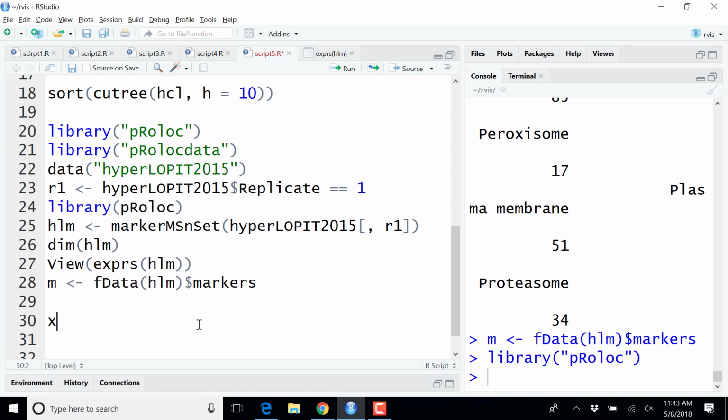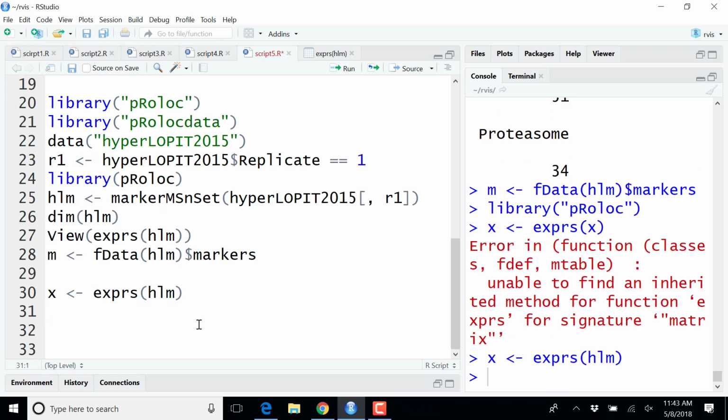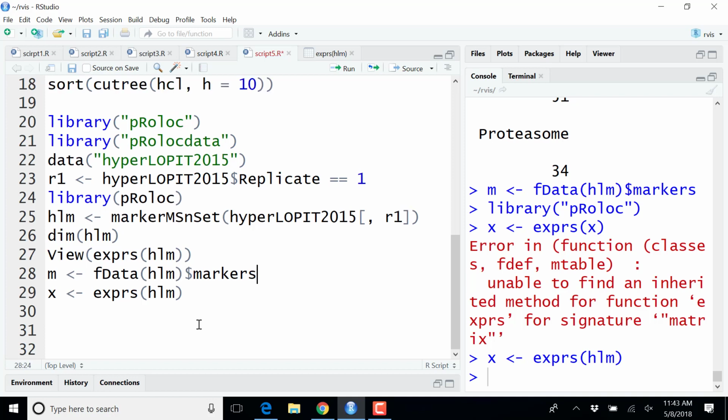So going here to temporarily create this other, I have these two variables: X that contains my matrix of interest, and M that defines the grouping in these different rows. Rows of my matrix are the proteins, and M defines the grouping.